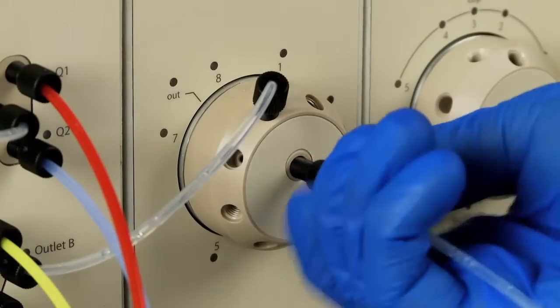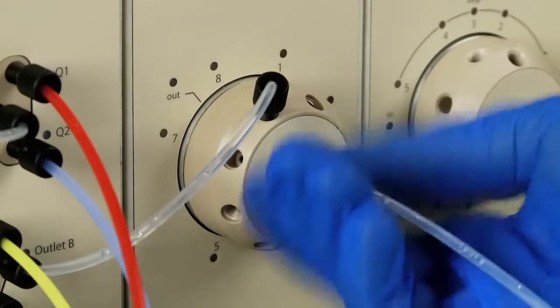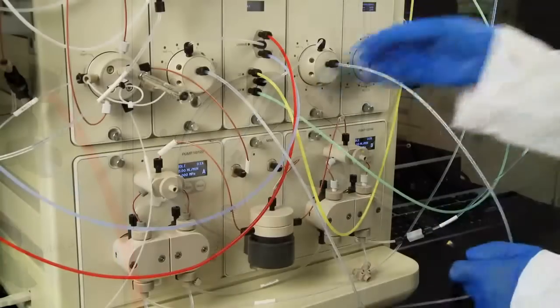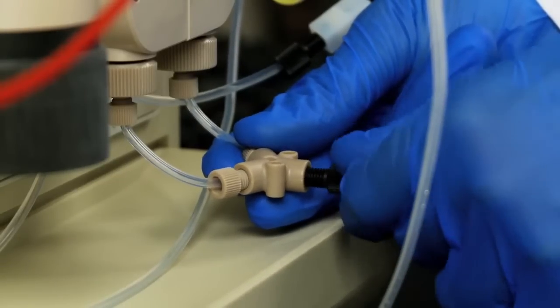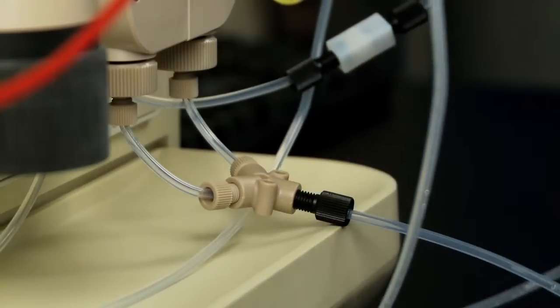Attach line number 6 to the outlet port of buffer inlet valve B, and then attach the other end to the inlet manifold for pump B. Securely tighten the fittings to ensure a proper seal and prevent buffer leaks.